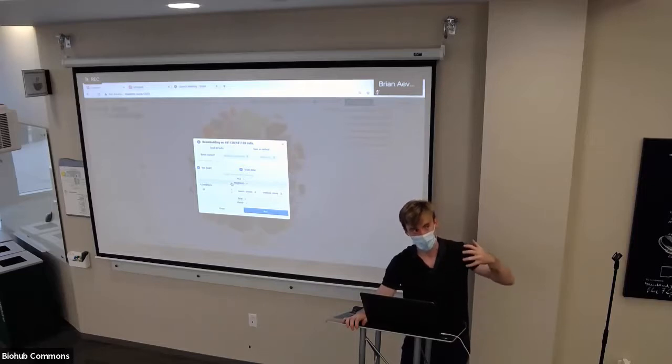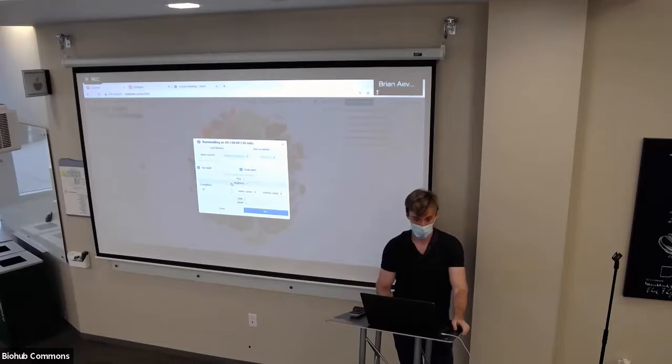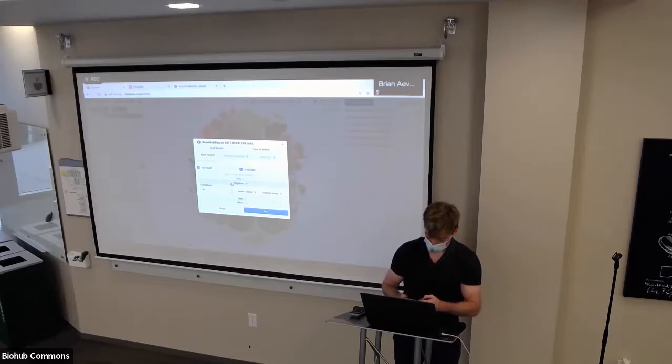They've shown that this is really useful for highlighting trajectories, because it's much easier to have connectivity between clusters that you know should be connected if you are just interpolating the cells between their centroids, as opposed to hoping that UMAP doesn't fragment them. So incorporating PAGA would be super great, actually. Yeah, even if it is just for a small subset of data instead of the 500,000 cells, like for a subgroup.